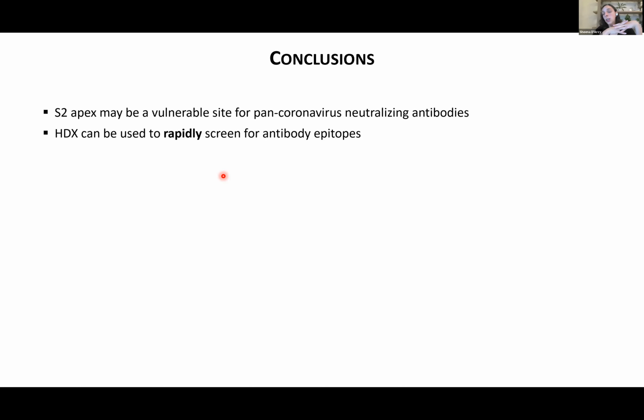Yeah, absolutely. And so that really has been the challenge with these enzymes that remove the sugars, because there were not many of them that were really active at the low pH. So you're absolutely limited, is what I'll say. So you want to keep it as close to pH 2.5 as possible and as cold as possible. But that being said, you of course have leeway either side. And so it really just takes a minute to optimize.